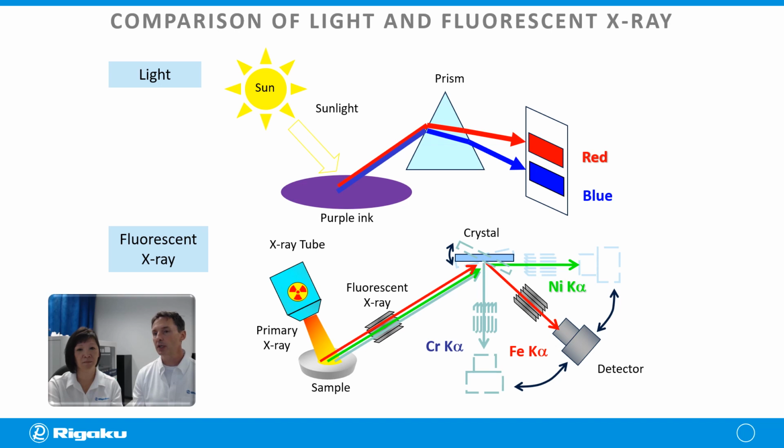Now, we've mentioned wavelength dispersive technology and energy dispersive. We show the different machines, and that's where I think it can be confusing for people just starting to evaluate this technique. So we're going to go into a little bit of what that means. Well, here we talked about matrix already, and the other thing we have to deal with, as with most analytical techniques that use the electromagnetic spectrum, is that you have overlaps.